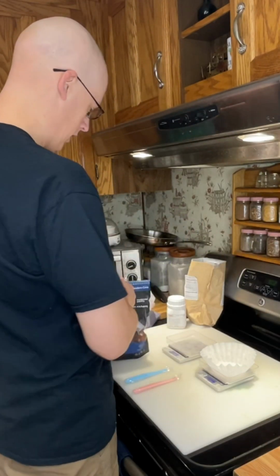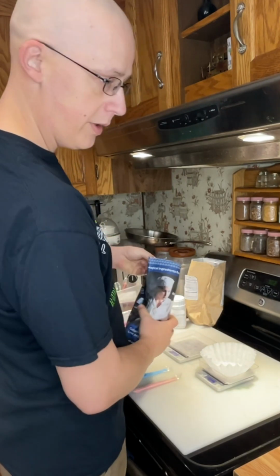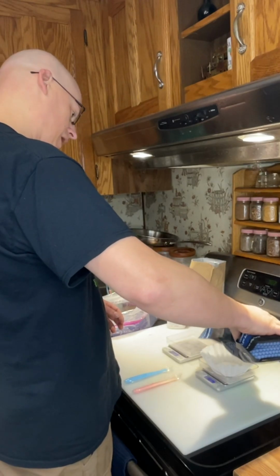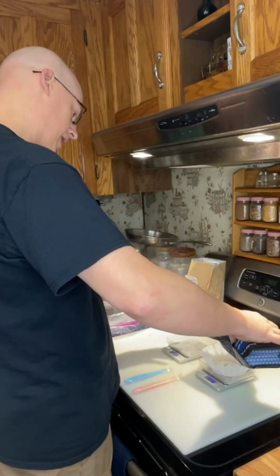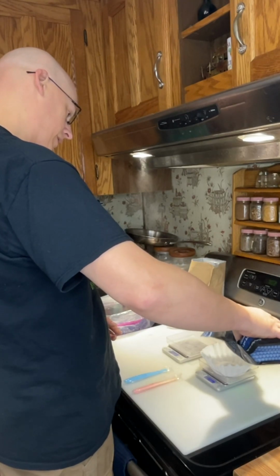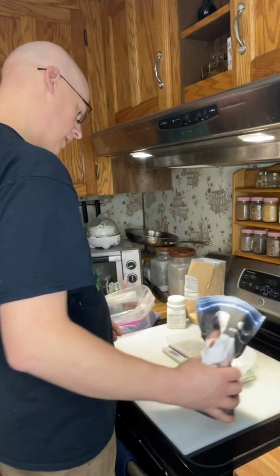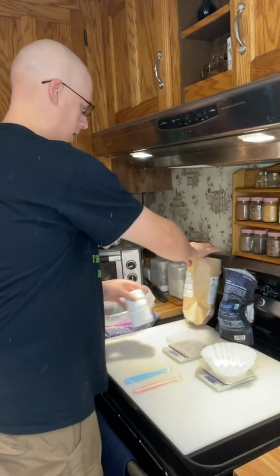This one we're going to go ahead and do a Gellan gum batch of potato dextrose. So this is going to be a really clear one. We're going to add 12 grams of this low acyl Gellan gum here. Very carefully. You can see the cloud of stuff here. That's why I usually use the fume hood, but I want you folks to be able to hear me today. All right, we got our 12 grams.